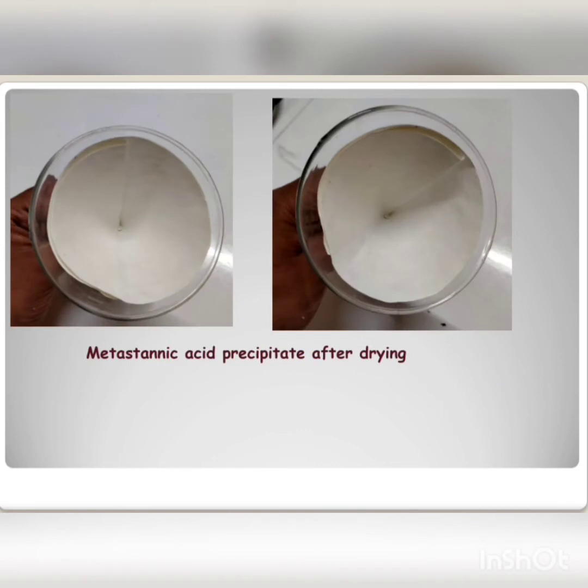Now this is nothing but the picture of the metastannic acid precipitate after drying. Okay, after drying it is looking like this. You can see the white in between.